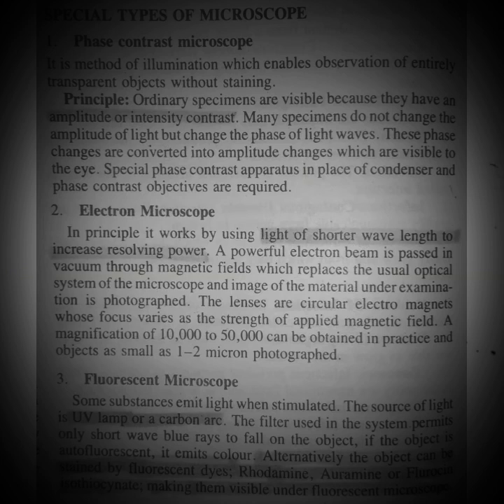Next is the electron microscope. In the electron microscope we use electrons. Let me read it. In principle, it works by using light of shortened wavelength to increase resolving power.